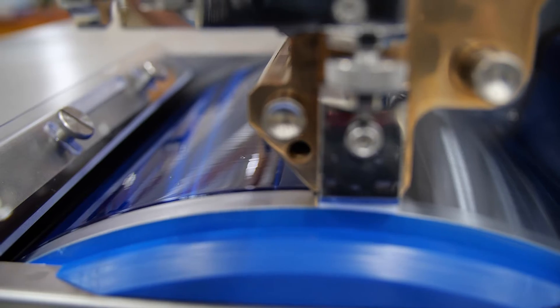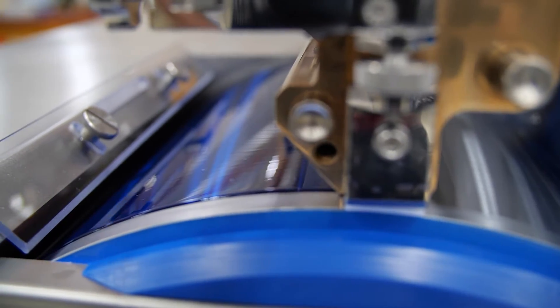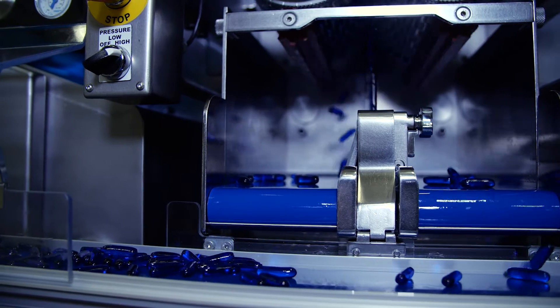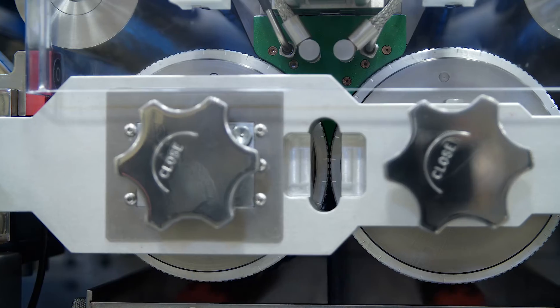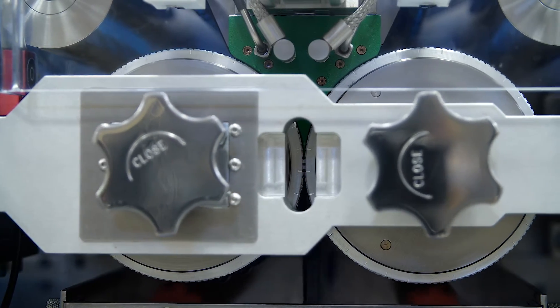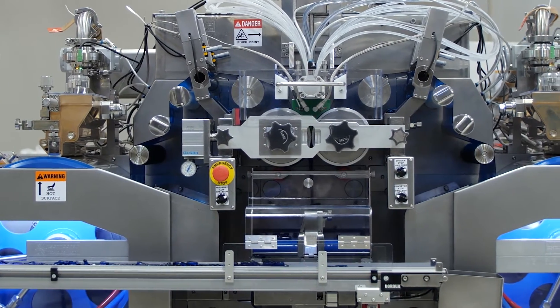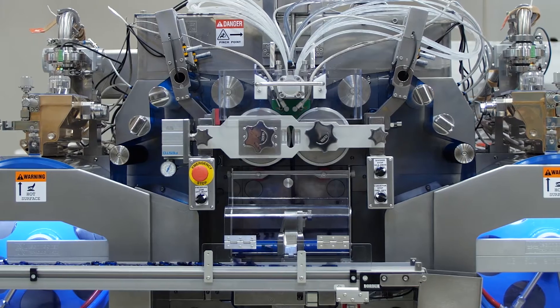During the encapsulation process, operator safety and product integrity are of the utmost importance. As such, the SGM 612 NextGen features transparent safety guards on its die rolls, wedge, conveyors, and mangle rolls, and also has optional full cover.